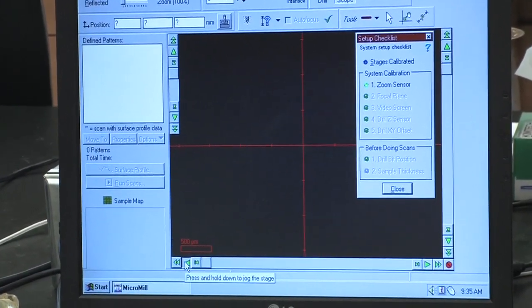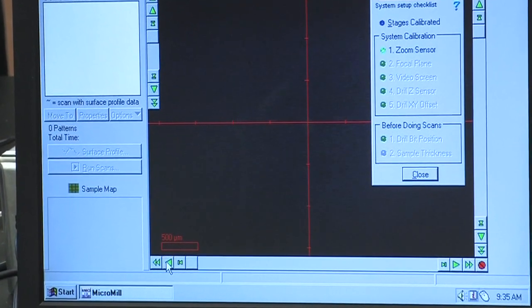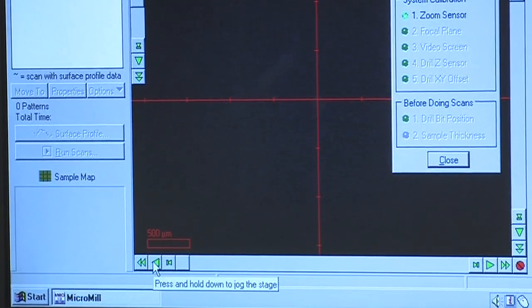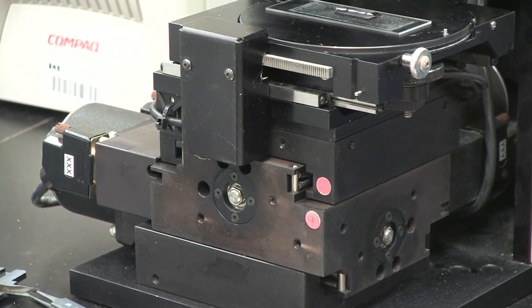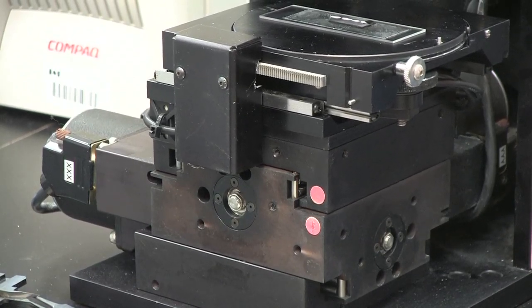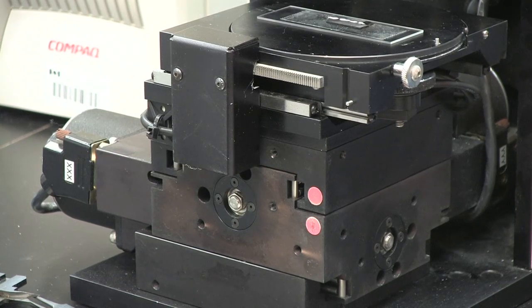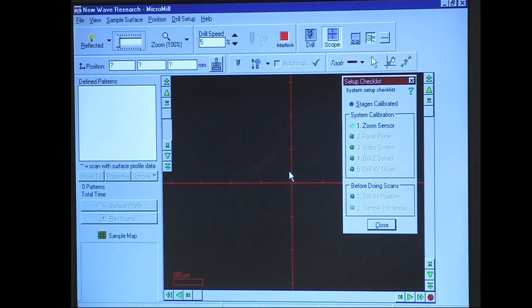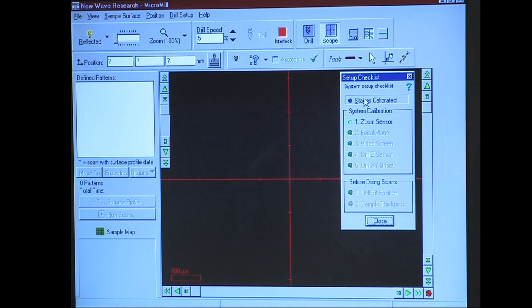Use these to line up both platforms for the X and Y axes as this is necessary to allow the full motion of the drill when coring samples. Line up the red dots so that both surfaces are flush on the stage. Once the X and Y stages are lined up, click on the Stages Calibrated button in the Setup Checklist window, and the X, Y, and Z stages will calibrate themselves.